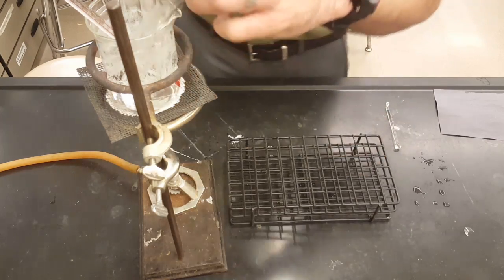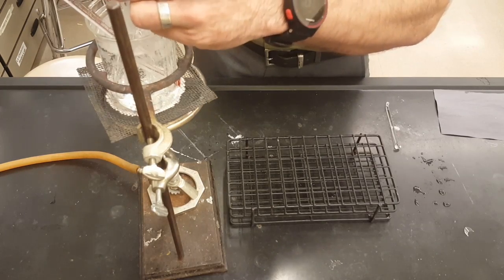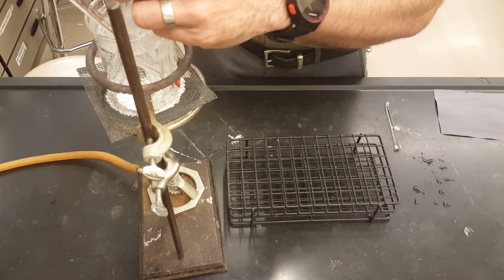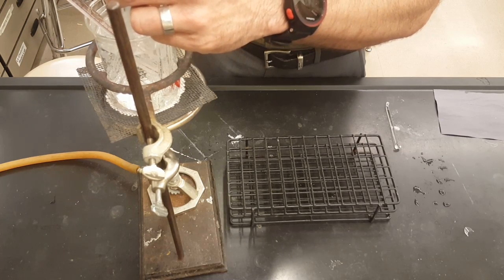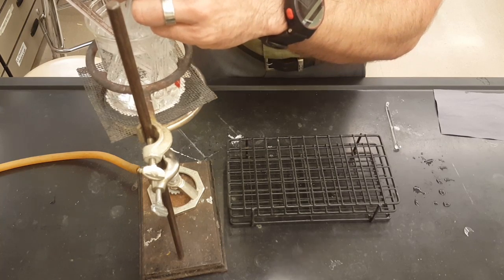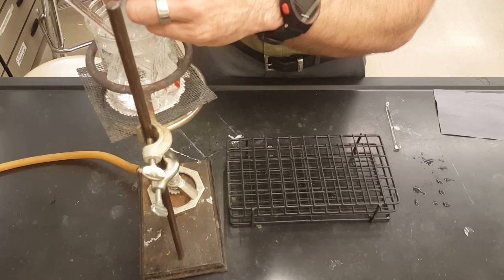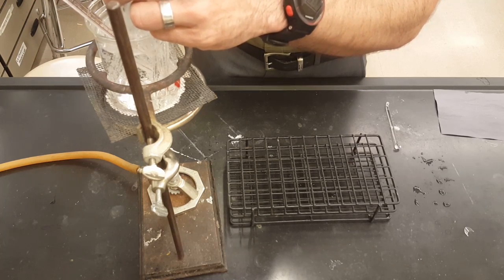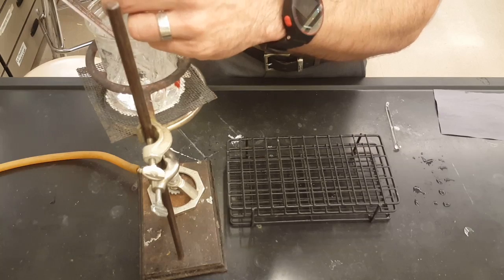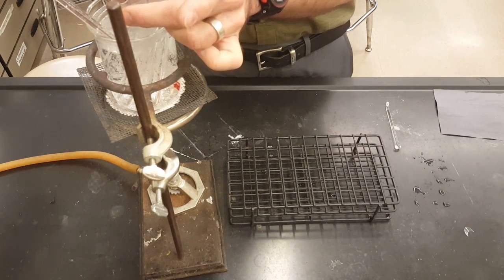So your salts are in your test tubes, and they're warming up, and they're starting to dissolve, and you'll take your stir bar and gently stir. If you jab at the bottom, the test tube will break open and you'll have to start over. This happened several times yesterday in Moody's lab. So you're stirring gently. Oh, do you see what I just did? I transferred one to the other and I'm mixing.